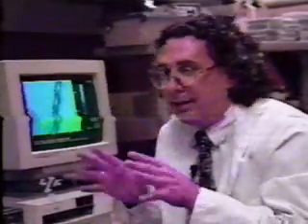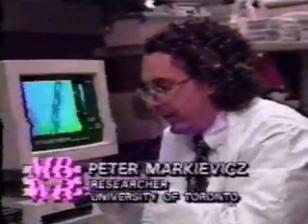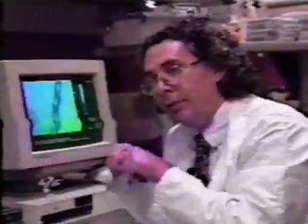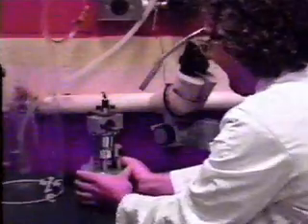It's essentially working like a record needle. Essentially, you've got a very sharp tip which passes over your sample. Because the needle on the atomic force microscope is larger than the actual protein filament, a mathematical equation was worked out to compensate for the needle's comparative largeness.